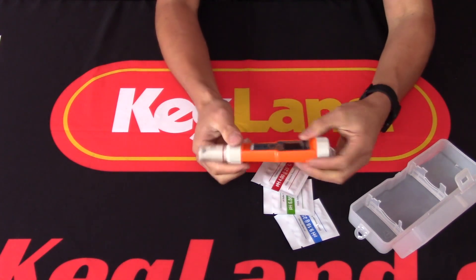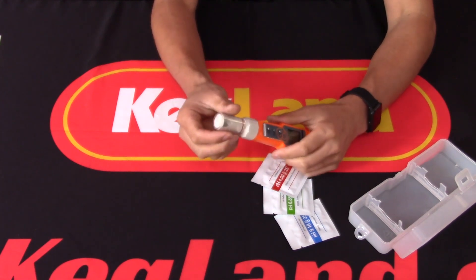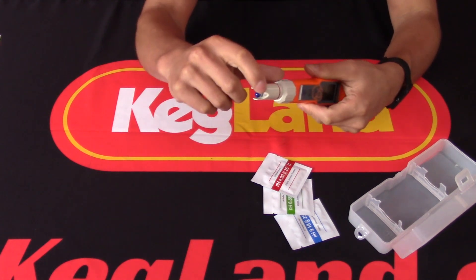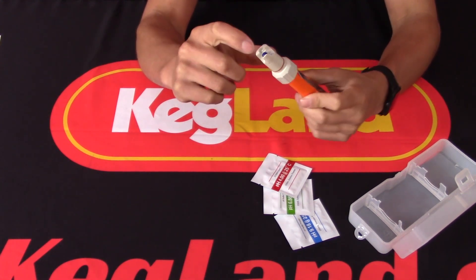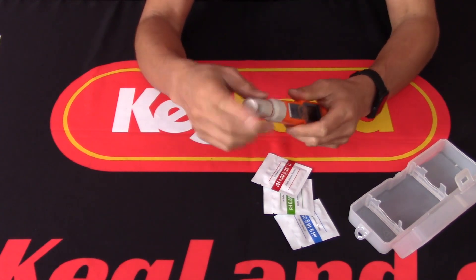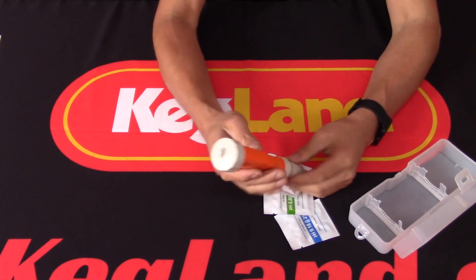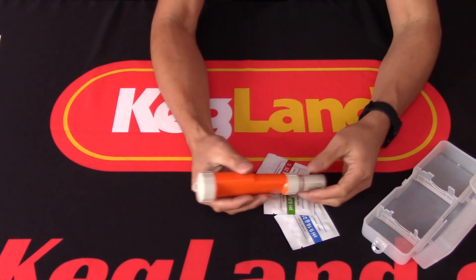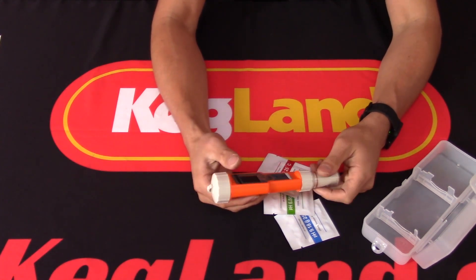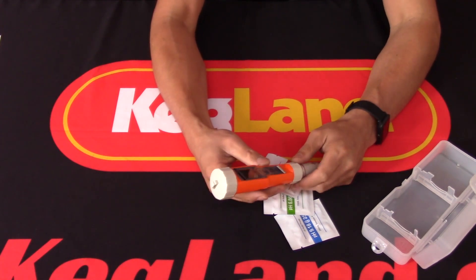We wanted to make sure it had ATC — Automatic Temperature Compensation — so the probe doesn't just measure pH, it also has a very small temperature probe on it. If you look closely, you've got the actual pH probe and beside that a temperature probe. The reason for that is brewers are often measuring hot wort and don't have the patience to let it cool to room temperature. Without ATC, you're going to get very poor accuracy.